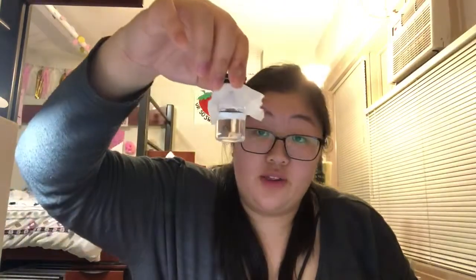It was also noticed that a significant volume of the water in the vial has evaporated since the last video entry. There are several environmental factors that may be affecting the growth of my crystal, one of which may be that it has been relatively cold outside. Because the temperatures outside have dropped, the heat in my dorm has raised dramatically.